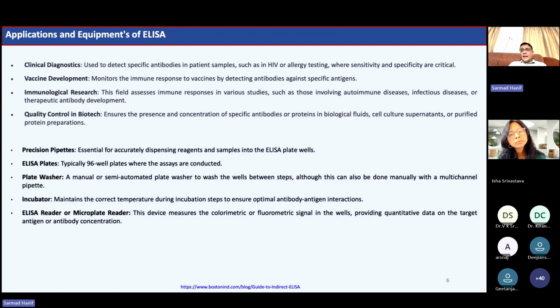The second is you don't have the positive controls, not positive controls of the study, but the positive control which is put in the plate, against which is a kind of standard curve. That standard curve is difficult to make for the emerging pathogens. Then you have the optimization, because results vary from lab to lab, person to person.